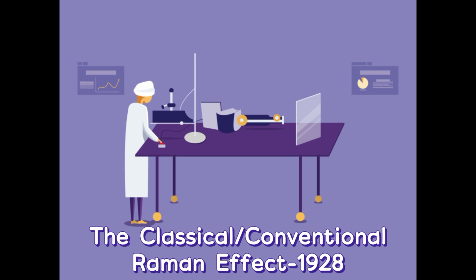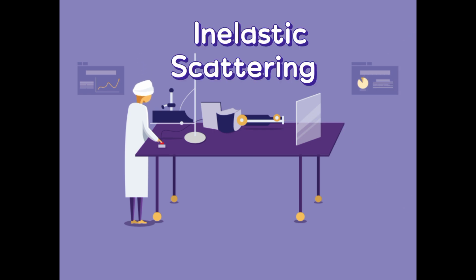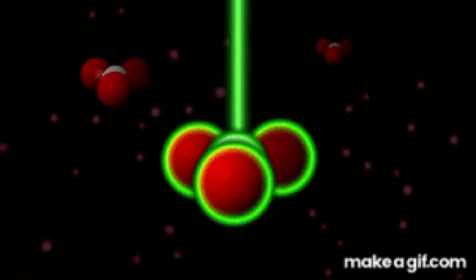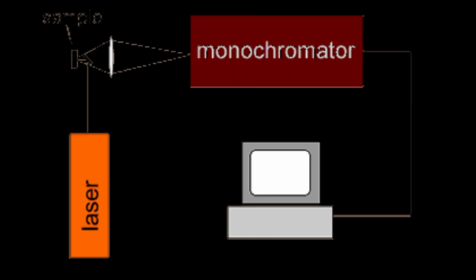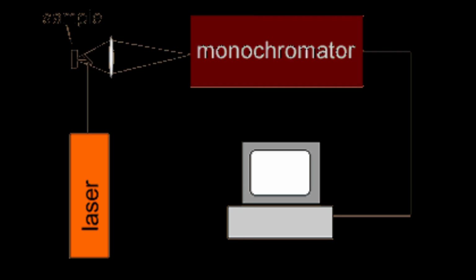The classical Raman, which was observed in 1928, was based on the inelastic scattering of photons, which results in a change in the energy of the scattered photons. The light from the laser interacts with the vibrational modes of the molecules to study the molecular structure, chemical composition, and other molecular interactions. The experimental setup was simple and smaller data was obtained in the classical Raman.